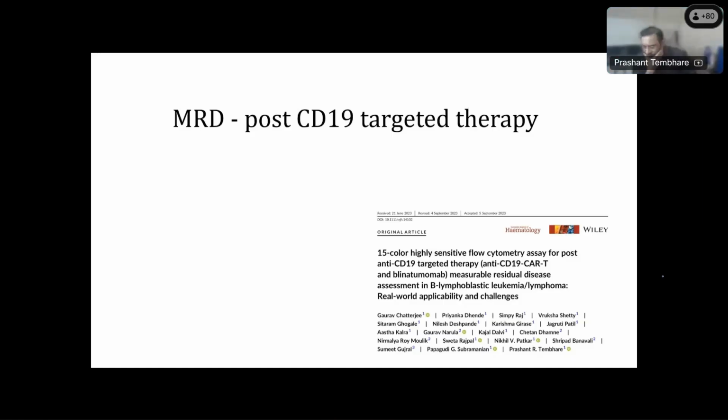Okay, sir. Next is, what is the CD10% which suggests hemodilution?